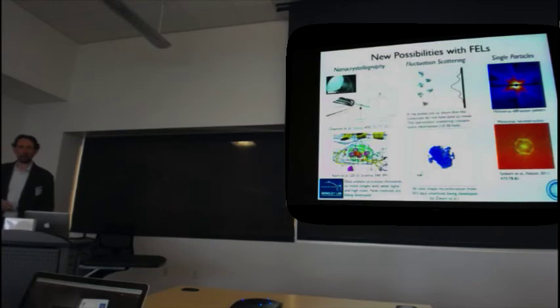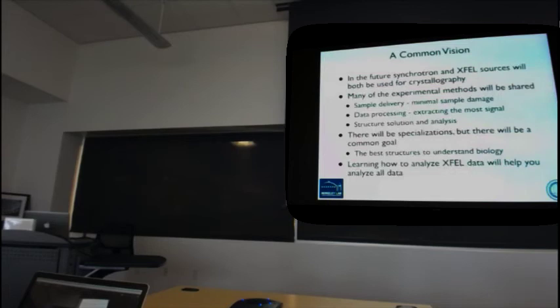So just to finish up, I would say that there's actually a common vision. This is sort of my prediction, that both synchrotrons and FELs will be used for crystallography in the future. And many of the experimental methods will be shared. We see the sample delivery has an impact in both areas. Data processing, trying to get the most out of the experiments that we do. And then, unfortunately, in a sense, the structure solution analysis methods are kind of common between the two sources. So we don't have to reinvent the way we solve structures necessarily.